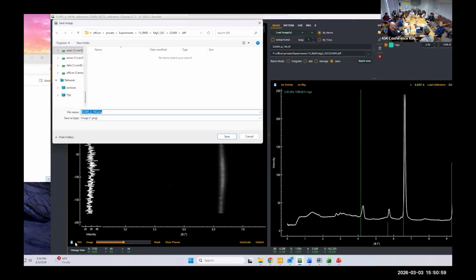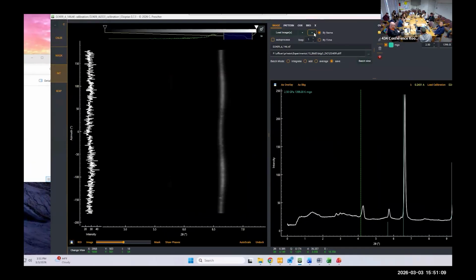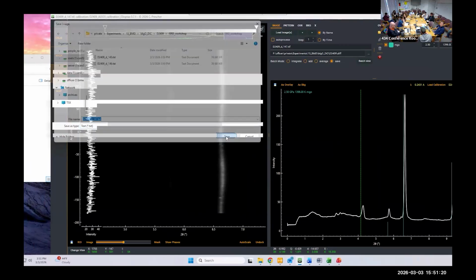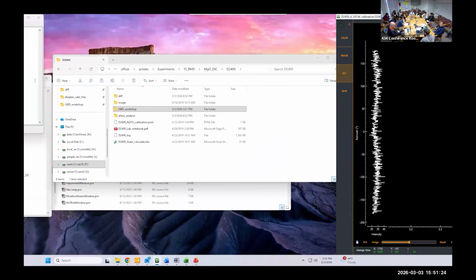I'm just going to do, because I did all this analysis yesterday, so I can show you what the results are. I even did this one already. Okay, so I'll just do those 3 for the analysis for now.